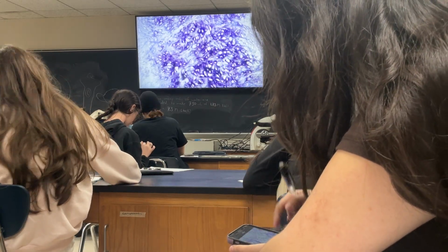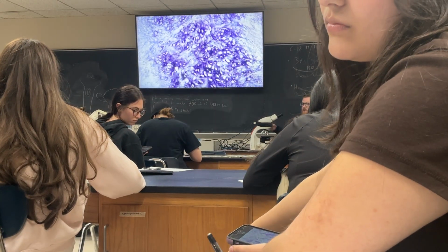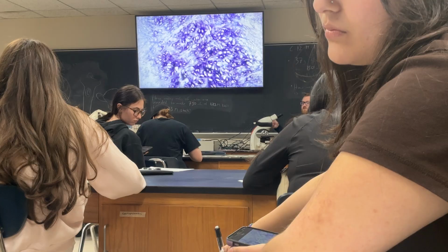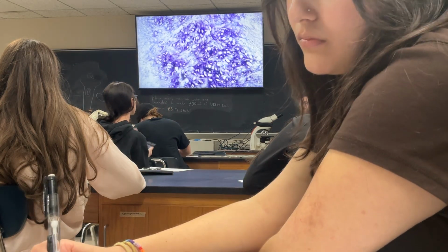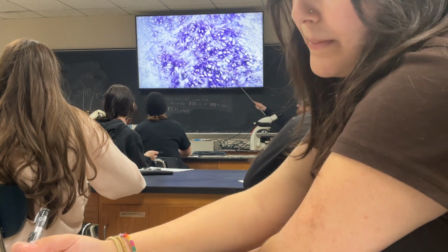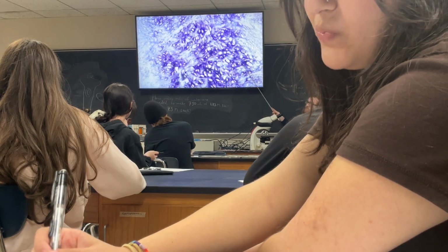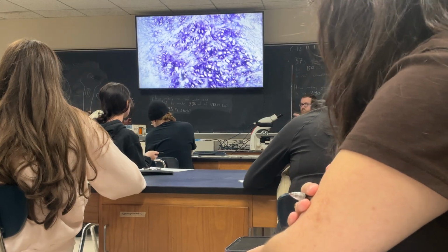Now, what are my three options for cartilage? Elastic, fibro, and hyaline. Hyalose means glass, so hyaline cartilage is going to look like smooth glass. What I think it looks like are grains of sand, because you'll still see this general pattern. It looks like grains of sand embedded in smooth glass. Is this glass smooth? No. This looks like shattered glass, maybe like really tiny spiderweb shatters.